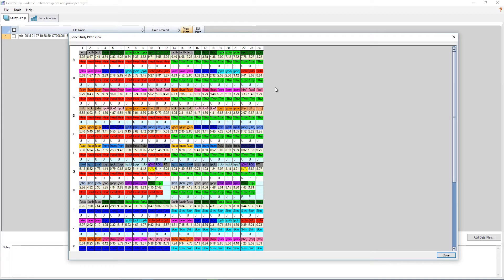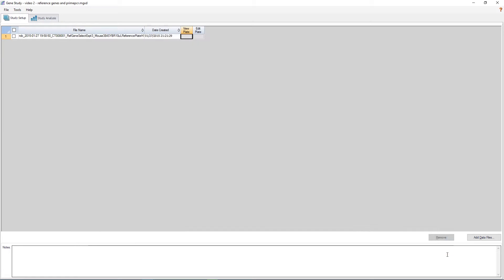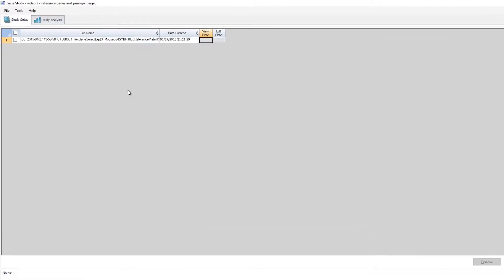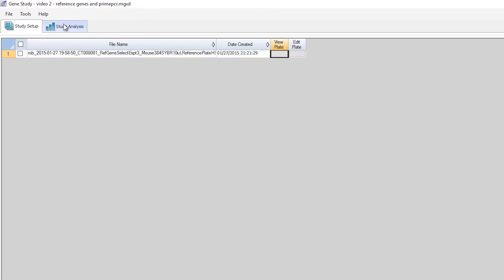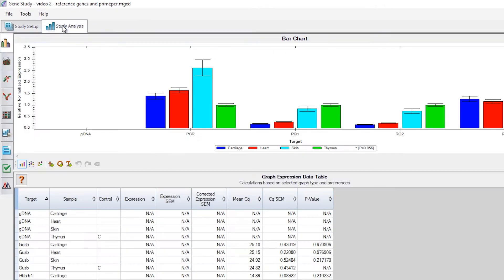Since we already have the plate added to this Gene Study, the next step is to analyze the results. To do this, click the Study Analysis tab at the top of the screen, then on the sidebar, select the icon for Reference Gene Selection Tool.